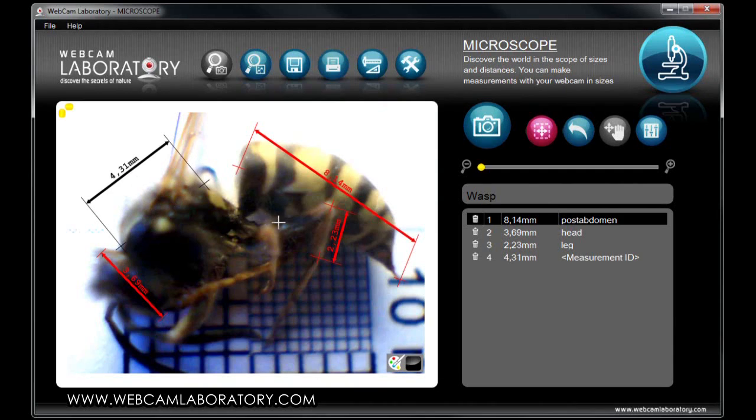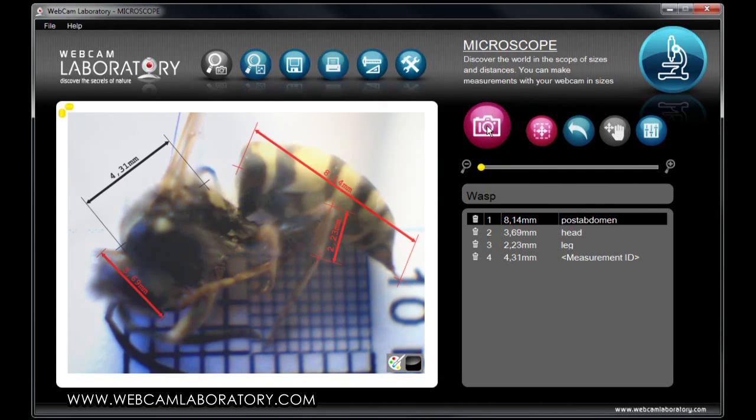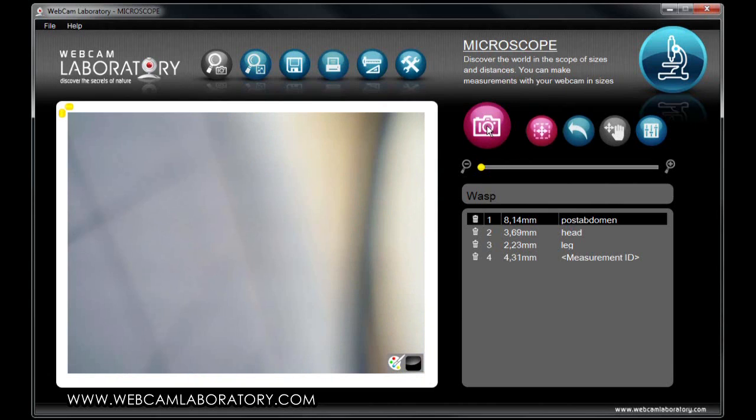Once you are finished with the measurement and have the picture saved, you can click on the make picture button and activate the camera feed to start the next measurement.